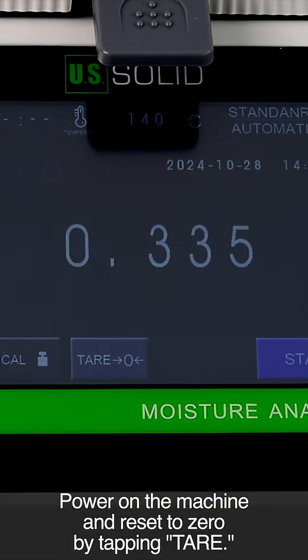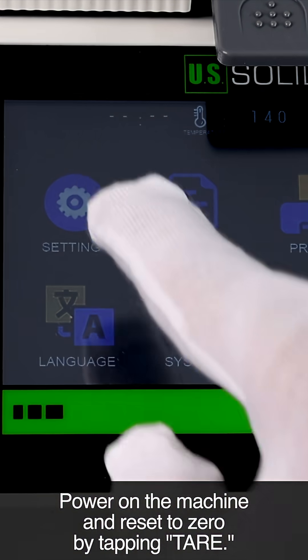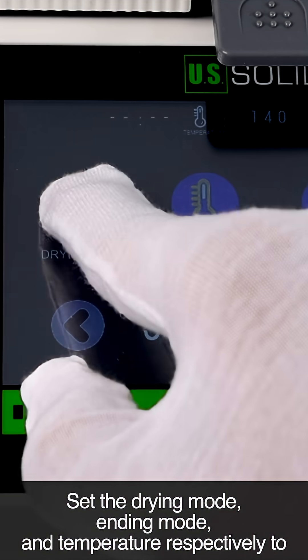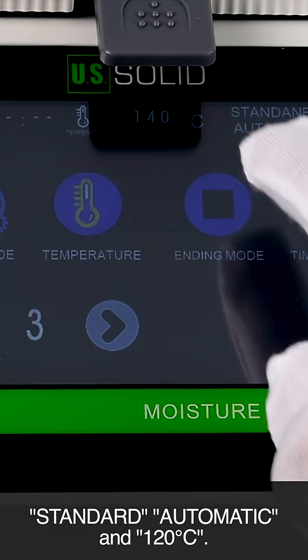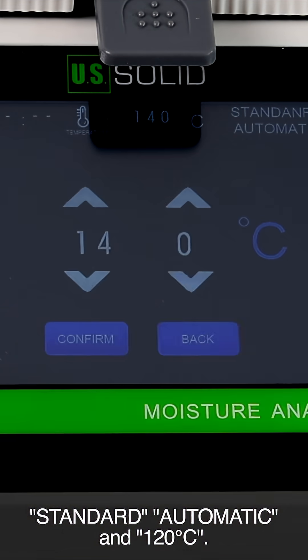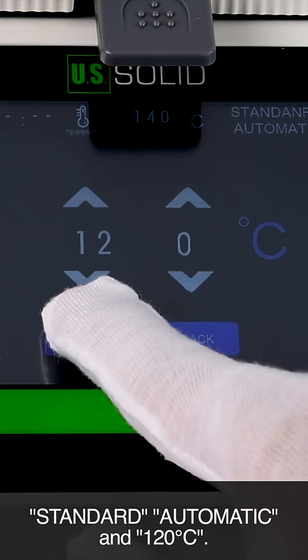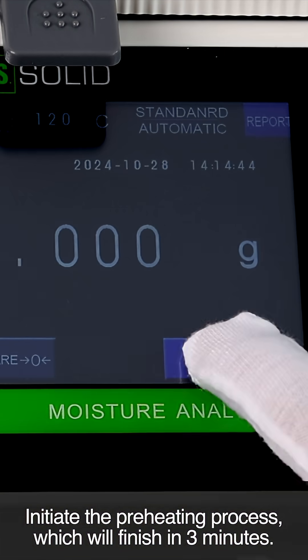Power on the machine and reset to zero by tapping tear. Set the drying mode, ending mode, and temperature respectively to standard, automatic, and 120 degrees. Initiate the preheating process, which will finish in three minutes.